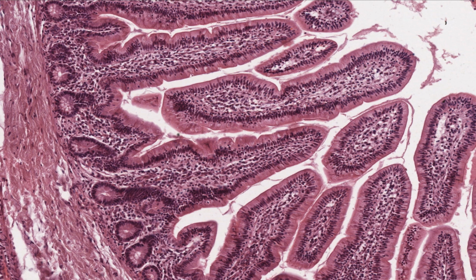Such connective tissue can be seen here in the duodenum. You've already examined the columnar epithelium over the villi of this section. Now look at the connective tissue directly underneath that epithelium. If you recall, we call this the lamina propria. Note how cellular it is.